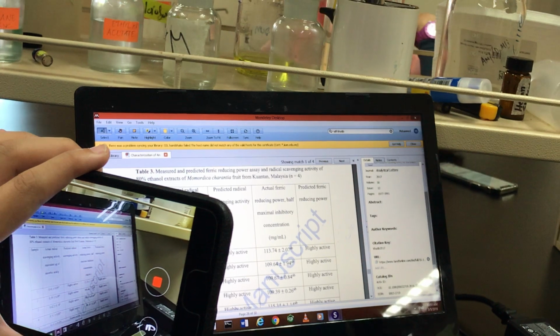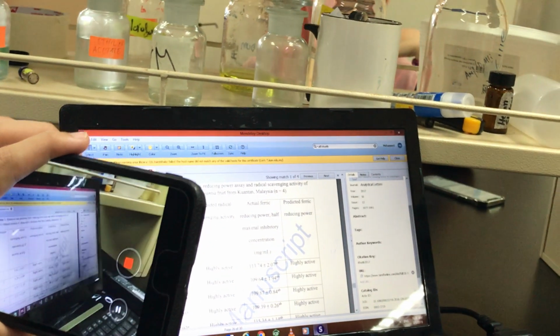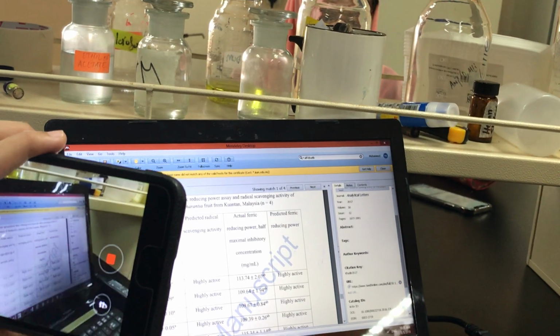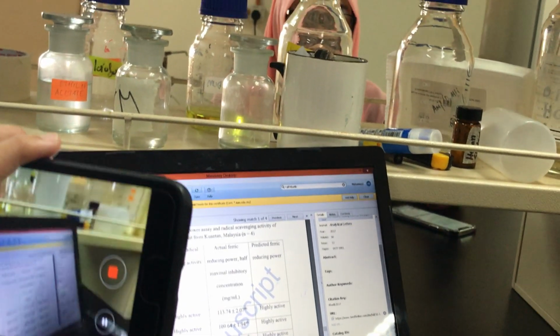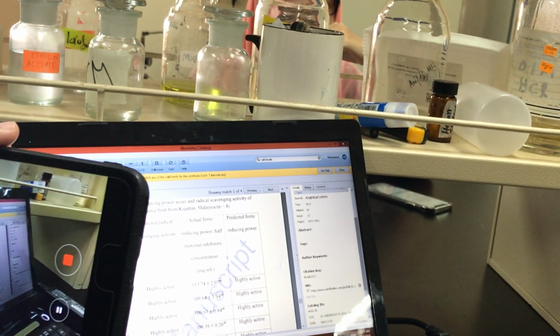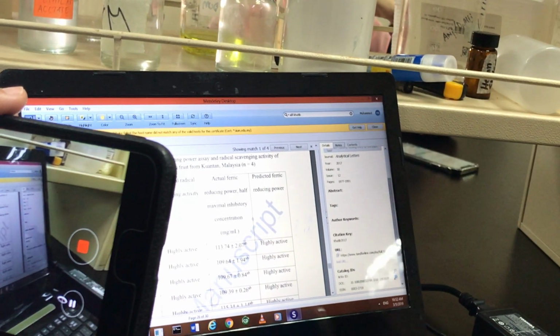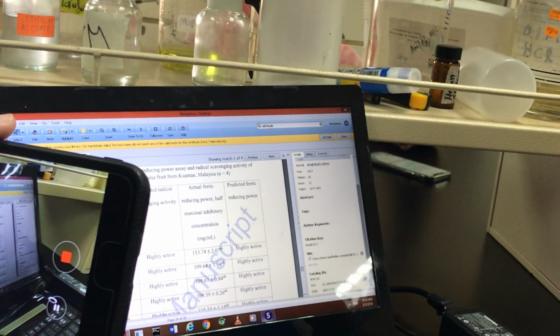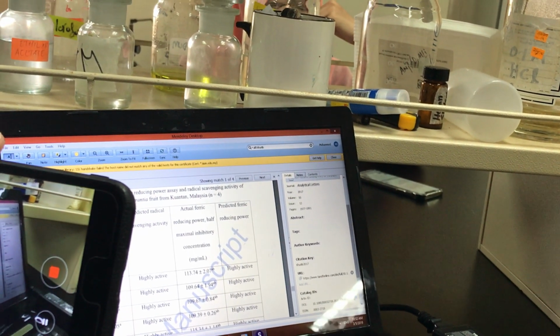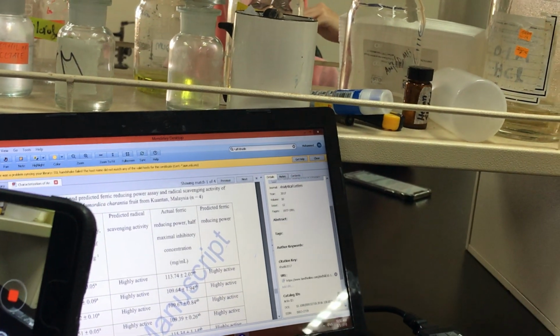I mean, the main reason for our result error is mainly due to technical error, right? No, no. I mean, because of the preparation, the compounds can be extracted. The main reason is that all the extracts were active. I mean, it's not technical error. This is not technical error in the IC50. The DPPH result is true.